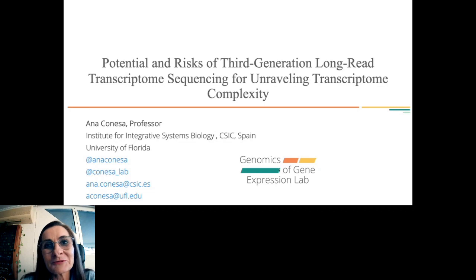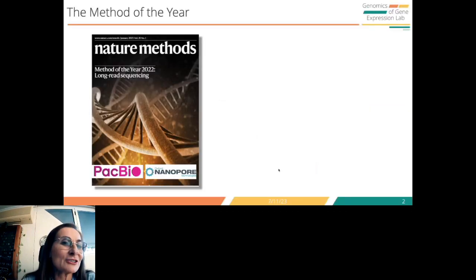We have already been working in the lab for quite some time on the utilization of third generation long-read transcriptome sequencing to study transcriptome complexity. You probably know that long read sequencing, the technologies developed by PacBio and Nanopore, have gained a lot of interest in recent years. Long read sequencing was even named Method of the Year by Nature Methods in 2022.